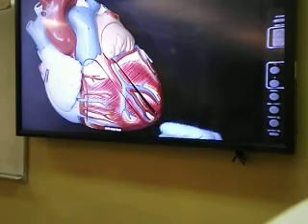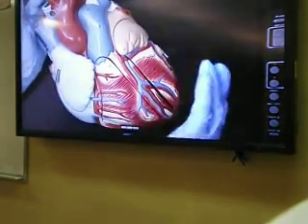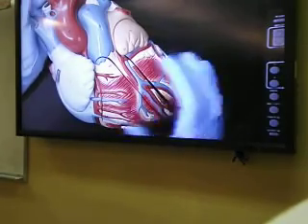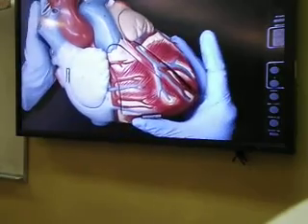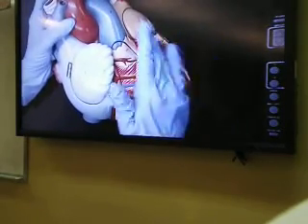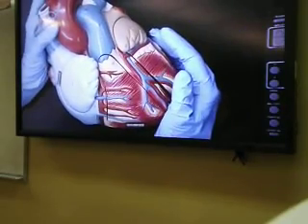So this is also reviewed from our last semester. We know the heart is located in the thoracic cavity within its own cavity, which we call the pericardial cavity. Always tilted to the left, since the left side of the heart is more muscular than the right side.